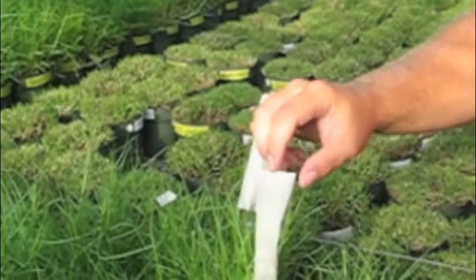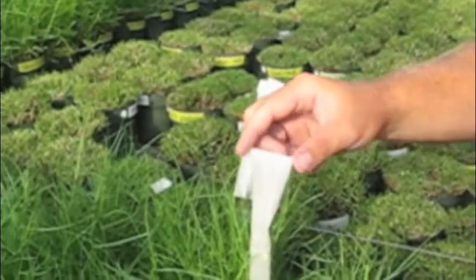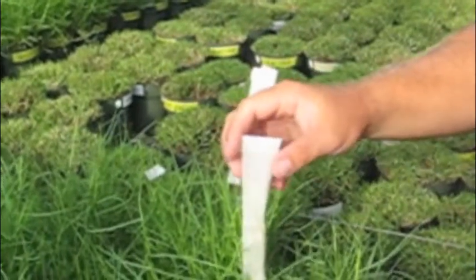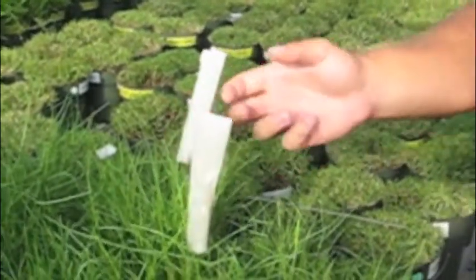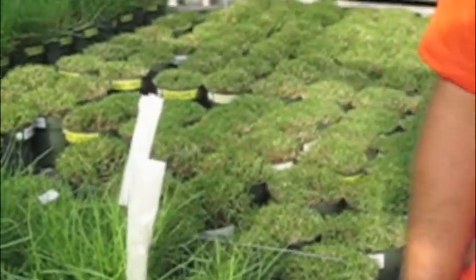We'd simply write the date on the top of the bag so we know when we made our cross. Typically we'll leave these bags on for approximately one week, which prevents any foreign pollen from getting on and pollinating our female plant.